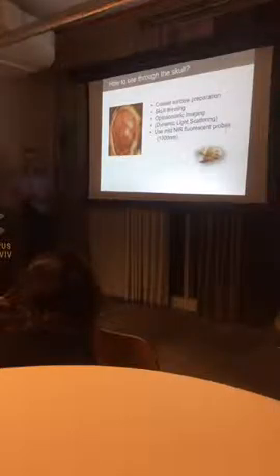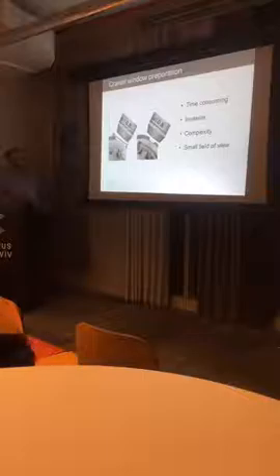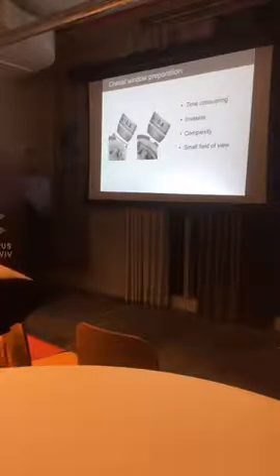Most of the techniques require drilling or doing something during surgery or using some specific efforts. This is what biology scientists do. They use either thinning of the skull or window preparation. And why do they do it?